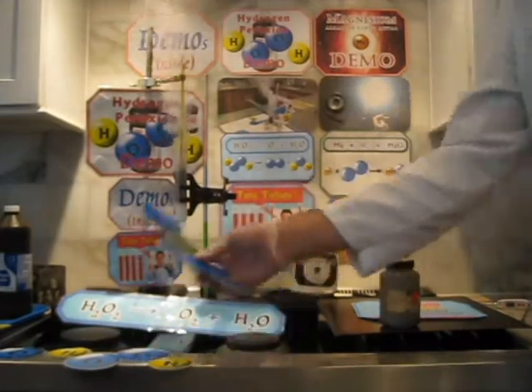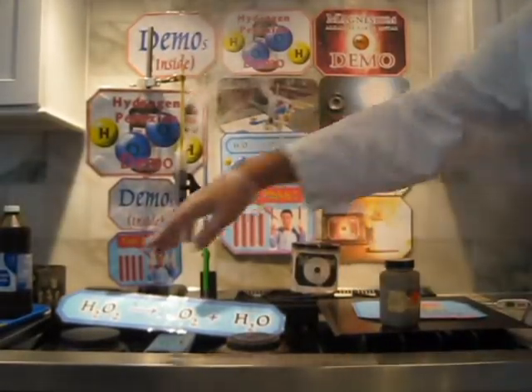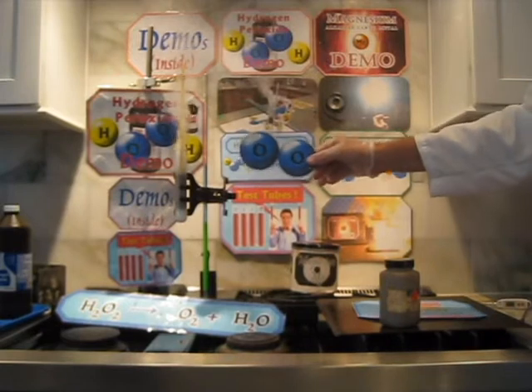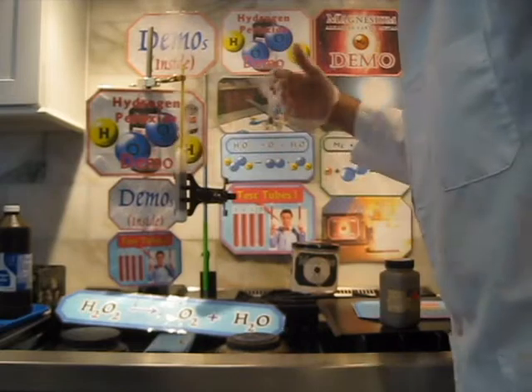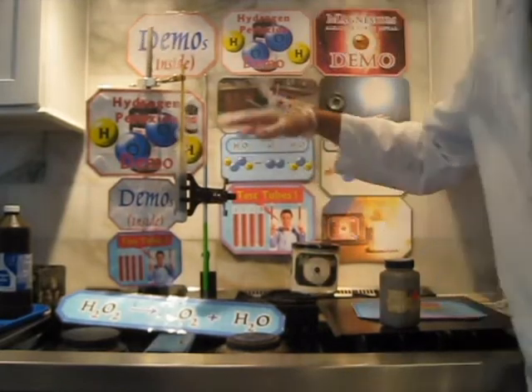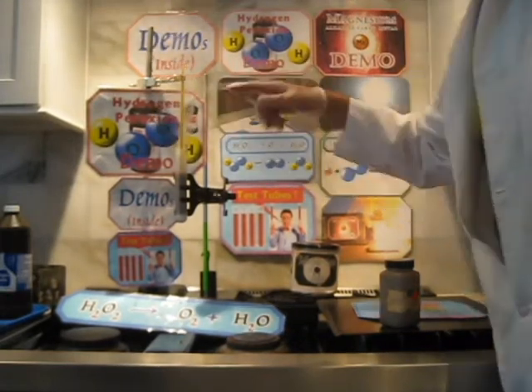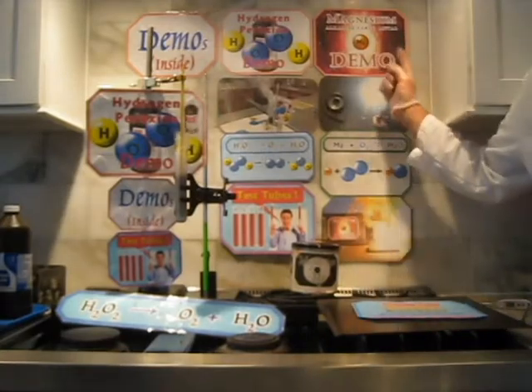So the great thing about that reaction is that it provides us with one of the things we need for our next reaction, which is actually the oxygen. That's one of the things we need. So I'm going to let that reaction keep going. That's going to accelerate our next demo. Okay? So notice I'm not in harm's way being right here, because what's being given off is actually oxygen and water. That's what that is. So I'm not being harmed here, but there's extra oxygen in this area. Maybe we can take advantage of that in our next demo. The next demo is the Magnesium Demo.